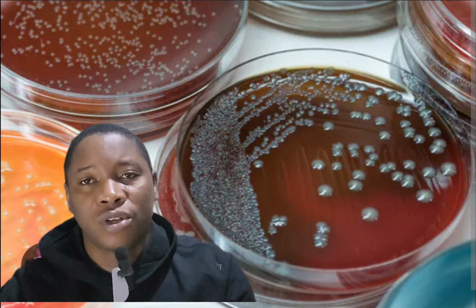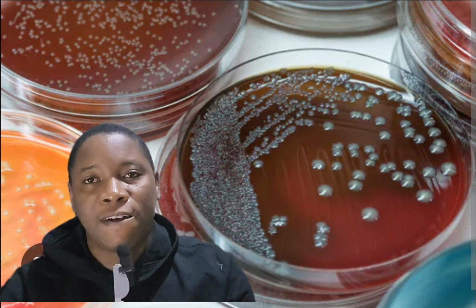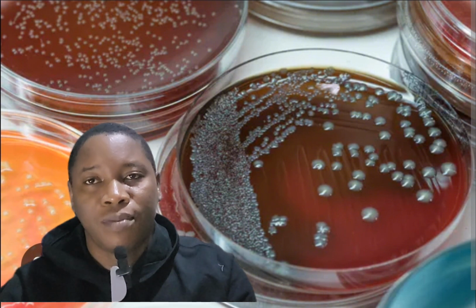I'll do a series of short videos this week where we'll talk about different methods of culturing microorganisms.